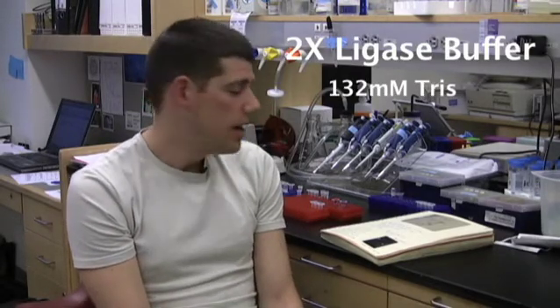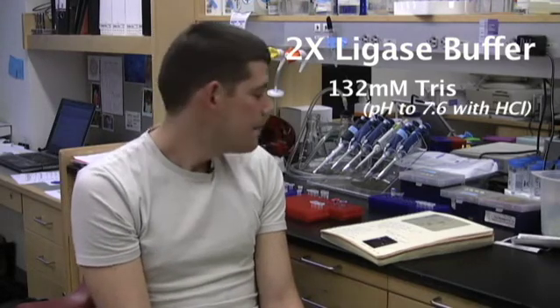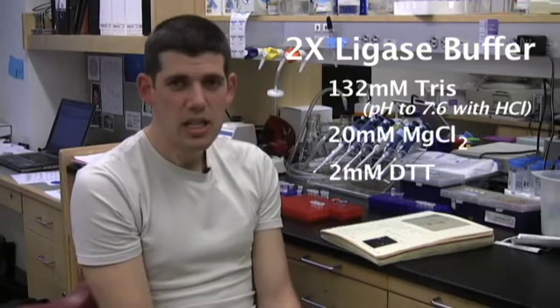For the buffer, I use 132 millimolar TRIS titrated with HCl to pH 7.6, then 20 millimolar magnesium chloride, and 2 millimolar DTT.